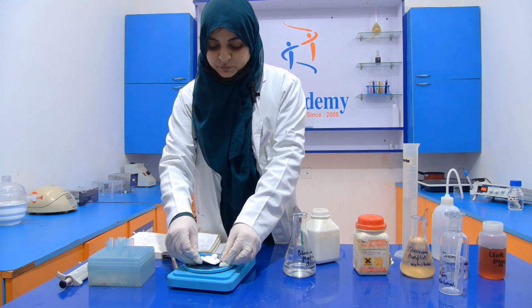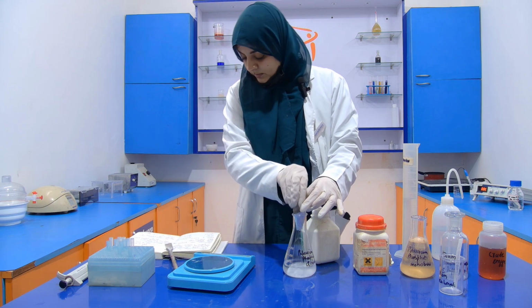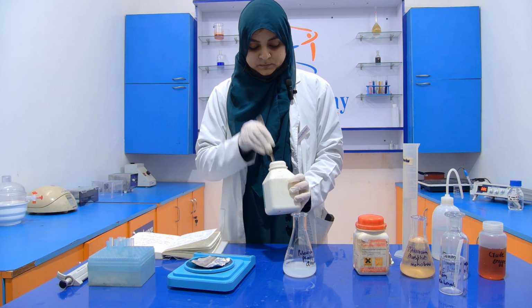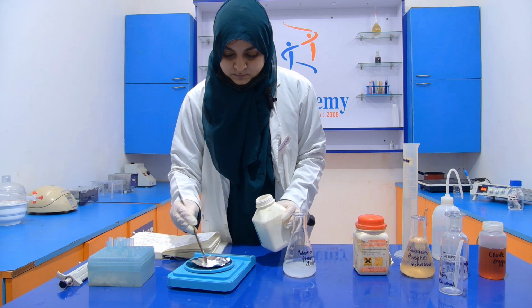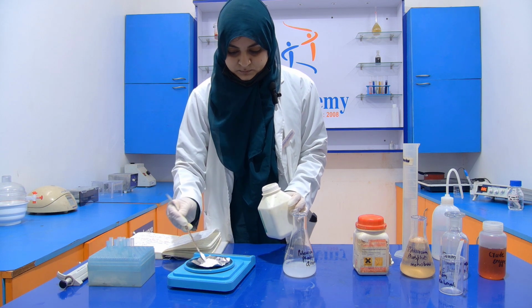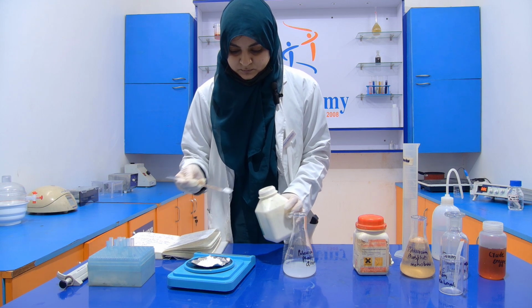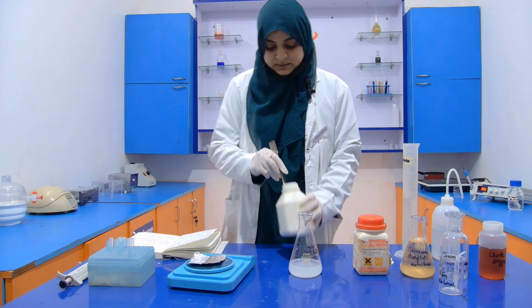So this is 10 gram. First of all, I am going to dissolve 10 gram into distilled water, then again 10, and again 10, making 30. Now the last 10 gram I am going to take.